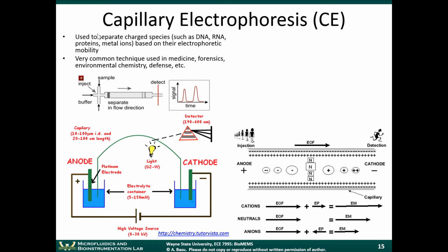So capillary electrophoresis is a little bit different from gel electrophoresis. It still uses electric fields to separate molecules, but the difference is that it is done in a capillary instead of a large gel. And the second thing is it doesn't require a gel at all.